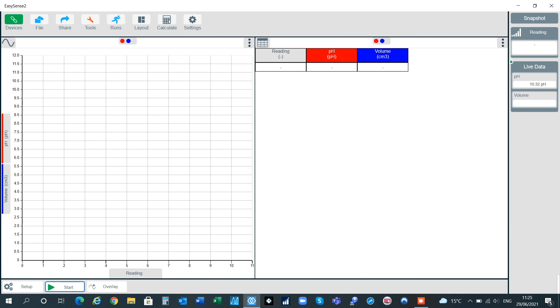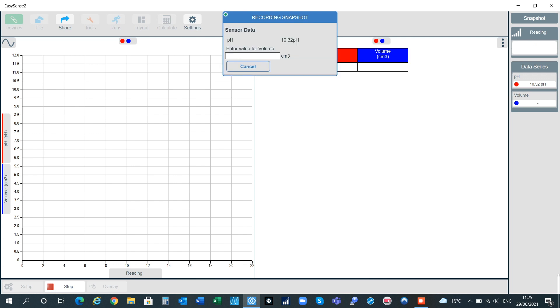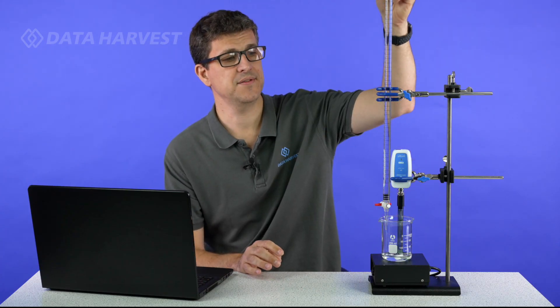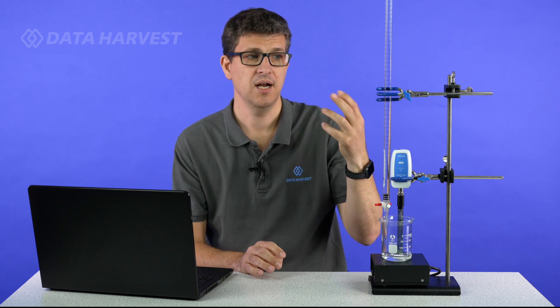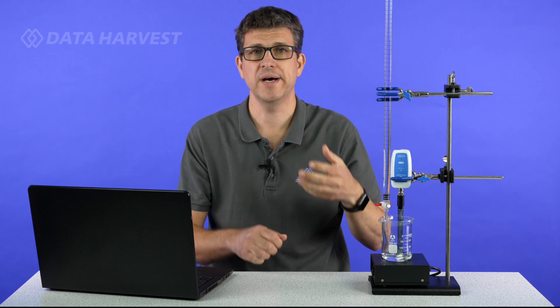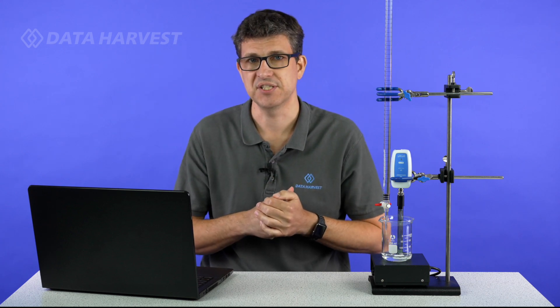I now click the start button. I'm going to take a sample to start off with so I now click take sample. On here is zero so I just add zero and save sample. Now my burette is going from one at the top down to 50 at the bottom. I prefer using it this way around especially with the students because you do one, two, three, four so you count it up as you go through after taking each reading. If you're around the other way sometimes they forget where they are so it's nicer to do it this way around.